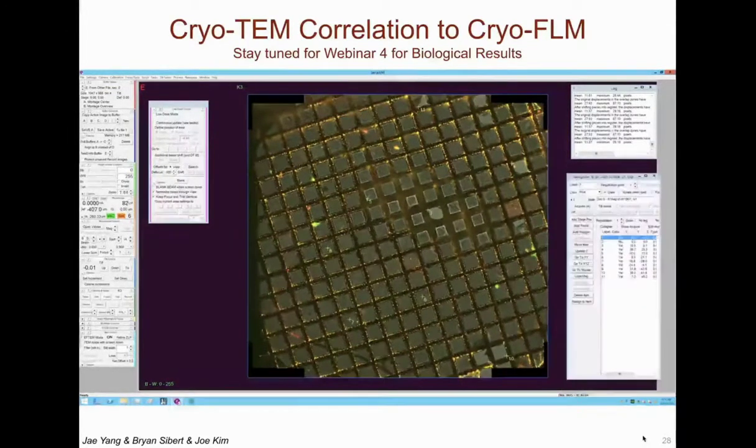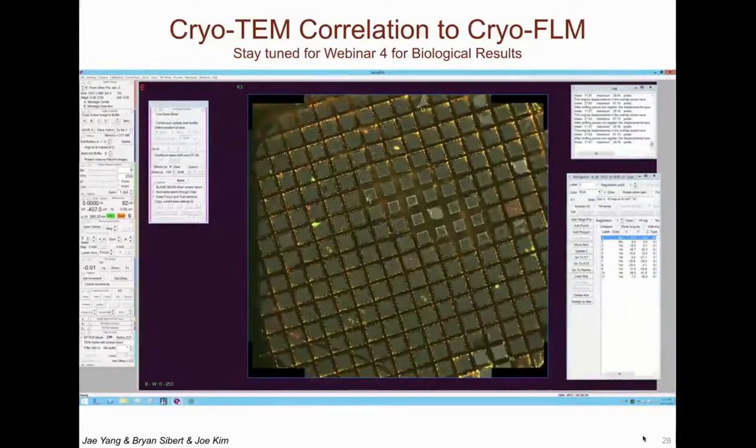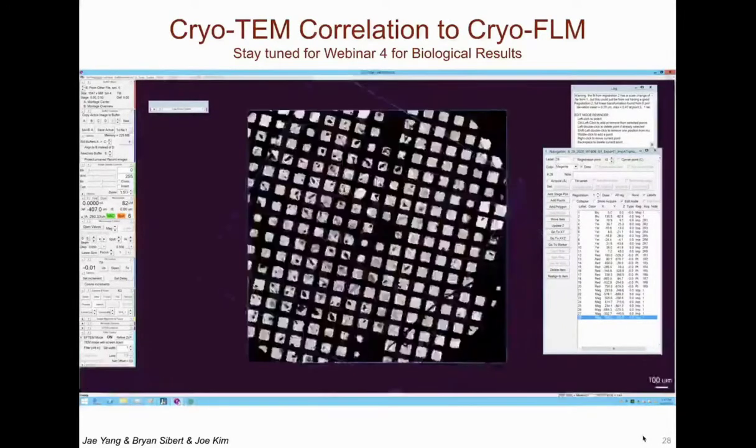Then you will import the navigator registration points, noted in yellow. From there, you will transfer the Cryo-CLEM image and the navigator points. This is followed by the transform process that will allow the image and the navigator points to transfer to the TEM map, pink and red markers.